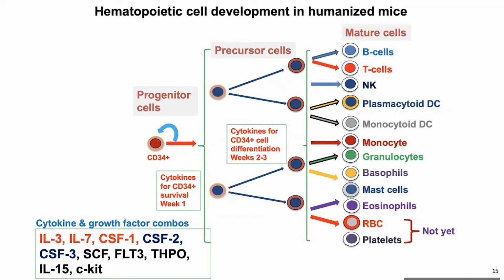These genes we transfected with the gene gun technology. It's an intramuscular transfection, and actually the secretion of these growth factors is quite robust. We detected it between 3 and 4 weeks, and one probably could find it more. And then one may also not need it for longer.